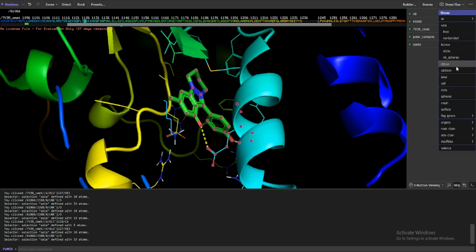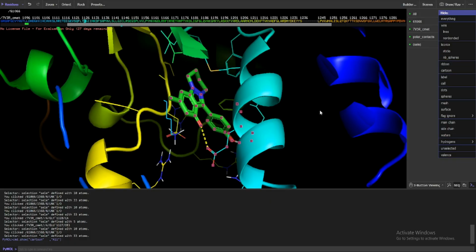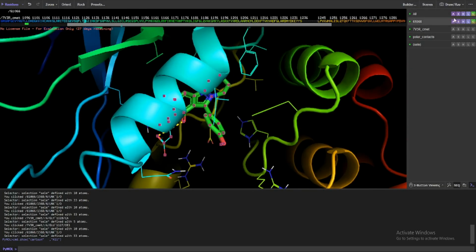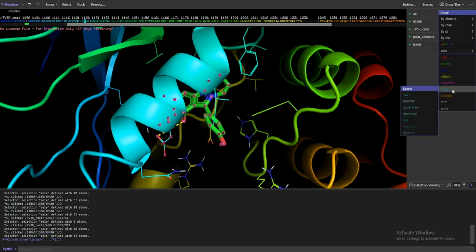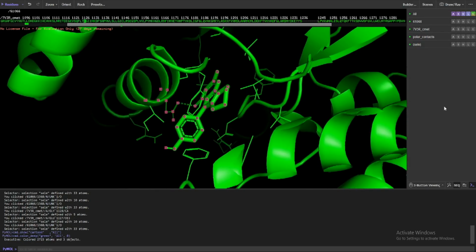You can visualize in different formats actually. So I think this is it. I will just show you how to visualize in Discovery Studio. You have other formats also. If you click on each of them, then you can see the distance also, you can see the binding affinity, you can actually select the colors of every single one, like if I select the green, then the whole protein or the whole ligand becomes green.